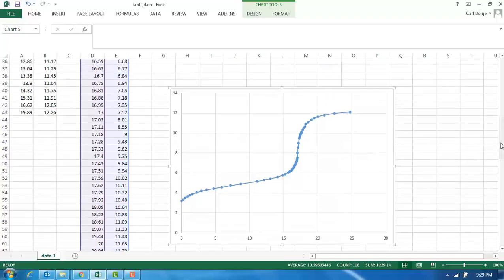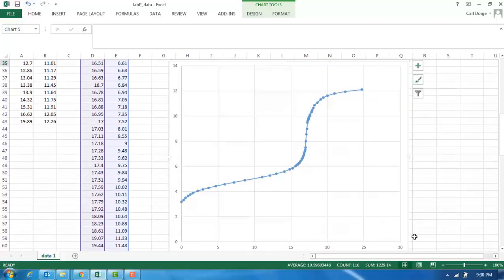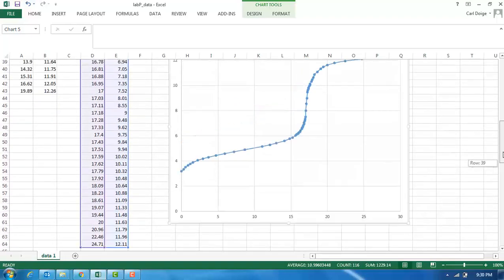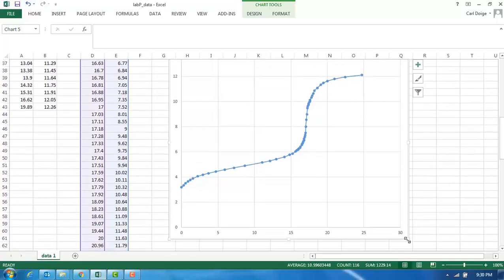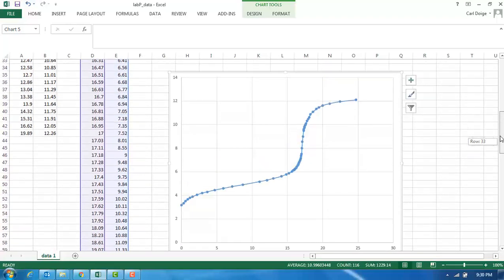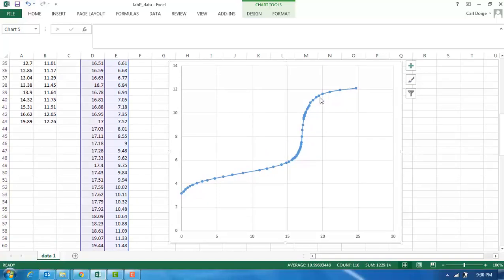What I'm showing you here is what you may want to be doing before you do that more fancy kind of data processing, when you still have the grid lines, because the grid lines will be useful to us. So you can see I've enlarged my graph. This is going to make it a little easier to work with. And I'd like to get the equivalence point based on analyzing this graph.